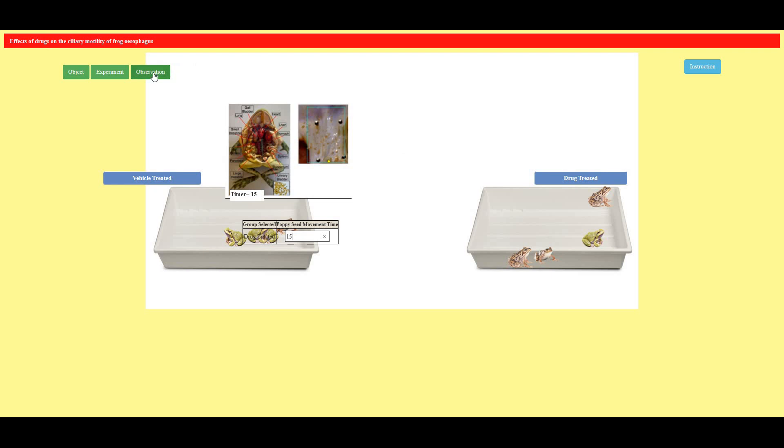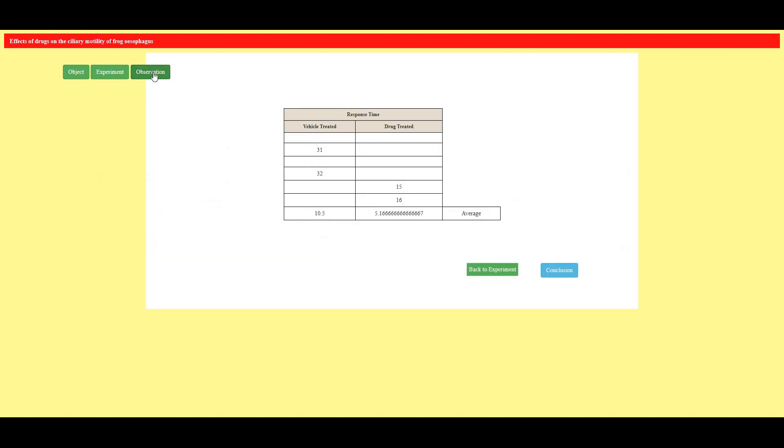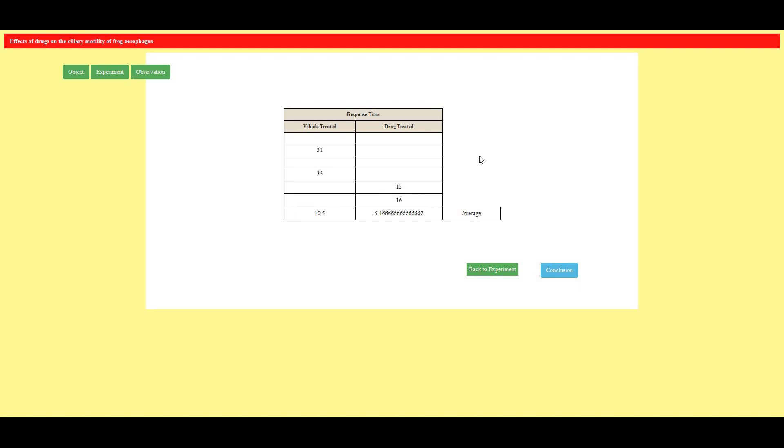So let's quickly see the observation table. So see this is my response table. In this table vehicle treated and drug treated. Here I have taken two observations that is 31 seconds, 32 seconds that is vehicle treated and this is 15 seconds and 16 seconds. These are the average values.